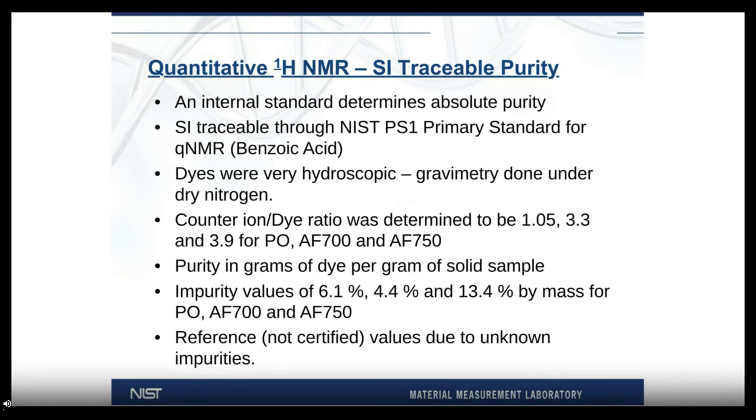And because of that, we had to determine purity for the 3 new dyes in terms of grams of dye molecule per gram of solid sample, as opposed to, say, moles of dye per sample, which we were able to do for the original SRM 1934.